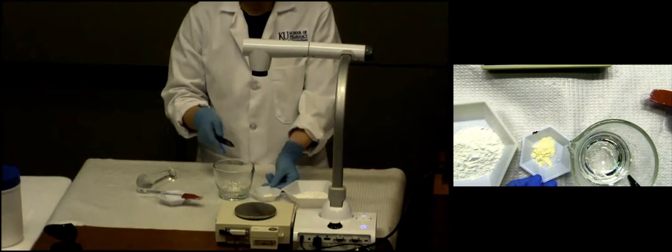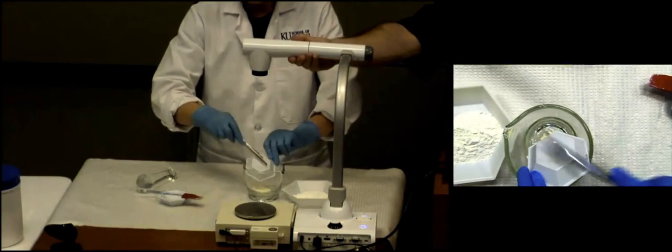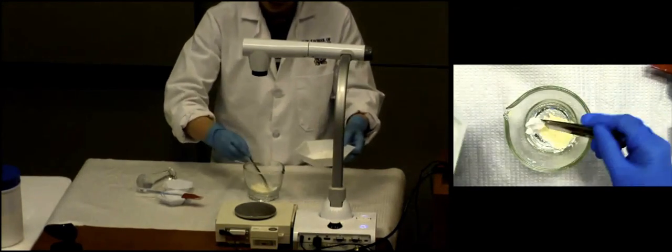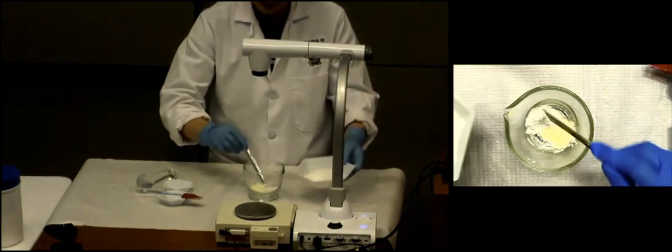So which one do you want to go in first? Definitely nystatin, right? Okay. All right. So now you're going to roughly estimate about a 1-to-1 ratio. Okay. I'm probably going to add a little bit more than I'm supposed to to save everybody a couple minutes.